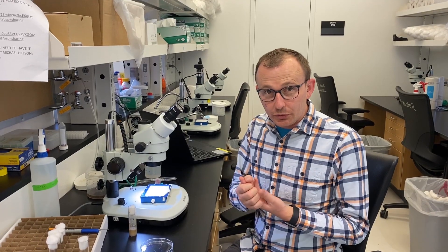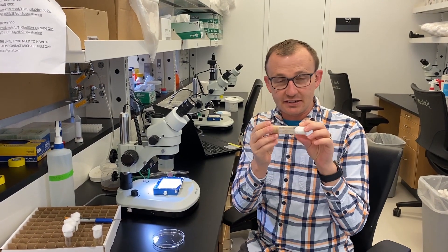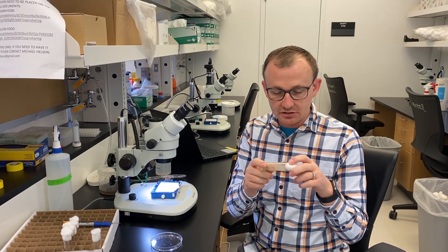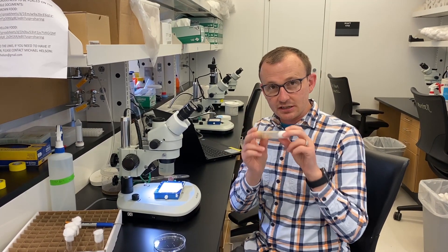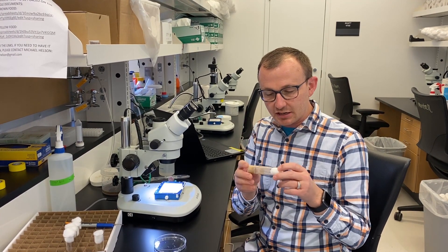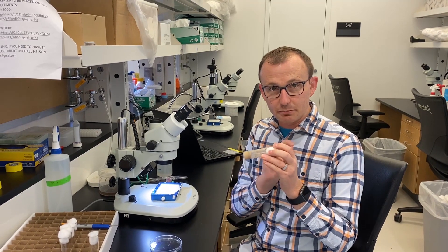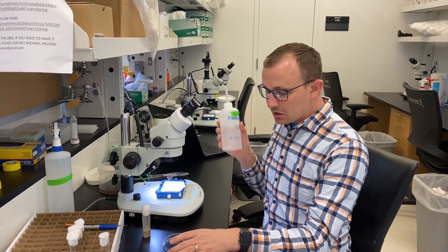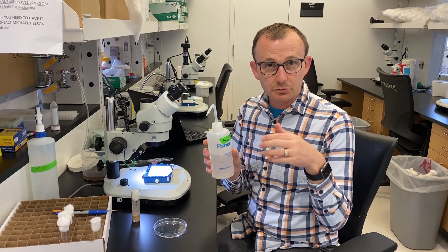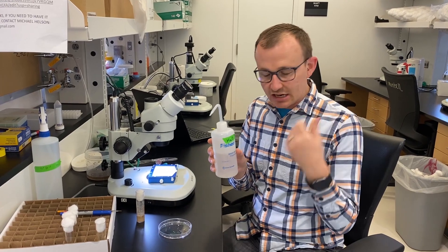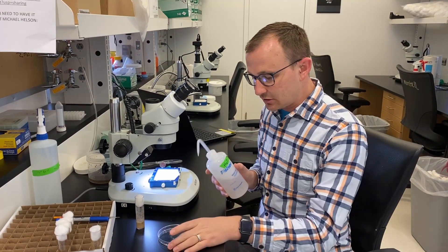Alright, so the way that we want to go about selecting the pupae is first we want to find a vial and dump any flying animals that may have been in there. Another nice way to check for virgins. I've recently dumped this vial so I'm ready to isolate some of the dark pupae that have crawled up the side of the wall.